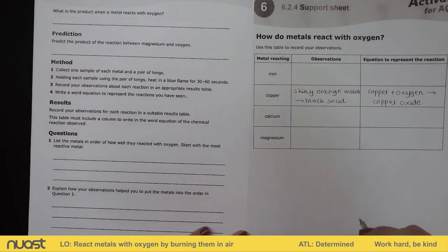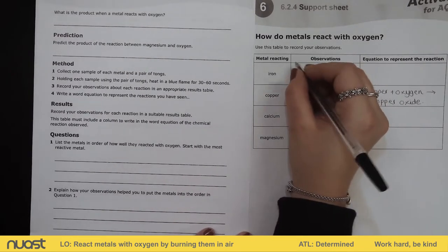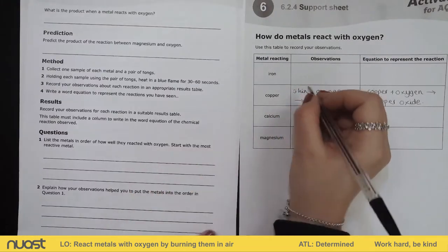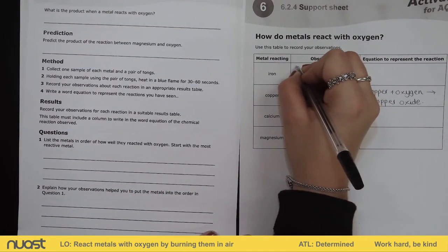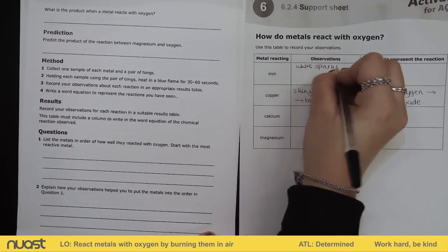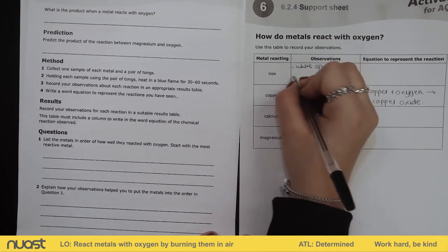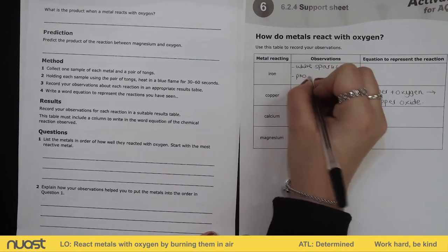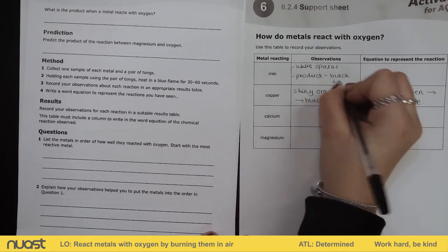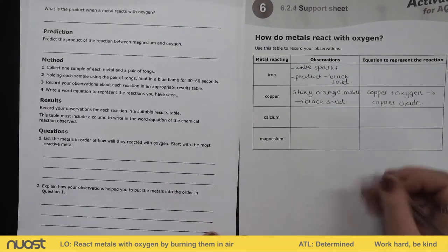Okay, so once again, we're going to fill in our table. So our observations, when we tilted our Bunsen burner and had our iron filings going through that blue hot flame, we saw some white sparks. Okay, we saw those white sparks as we were passing through the Bunsen burner. And then our product was a black solid. Okay, it got a bit darker. Obviously, originally it was a dark grey, but it did get slightly darker.